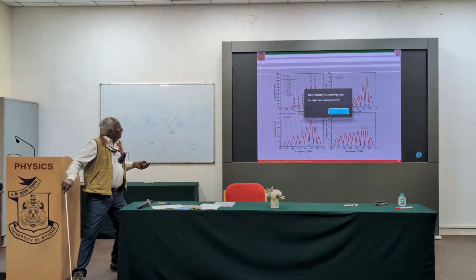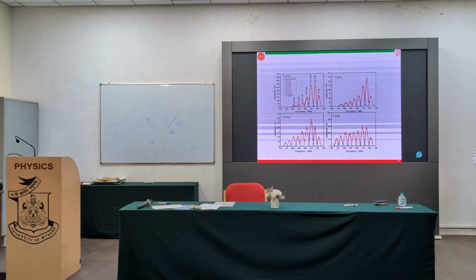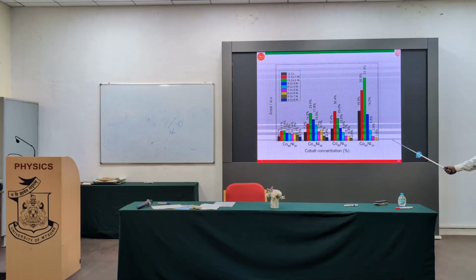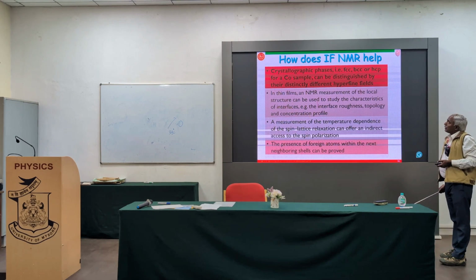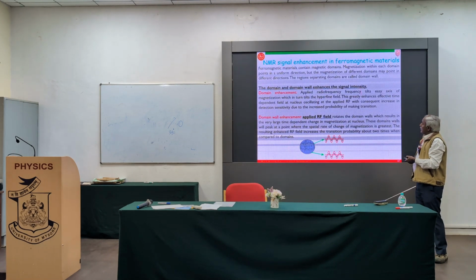Now, if I have to represent the same thing in a quantitative way, I can estimate the composition of each atom, or how the values are correlated. But the basic composition over there is crystallographic phases, whether it is FCC or BCC. One of the data I did not show you.